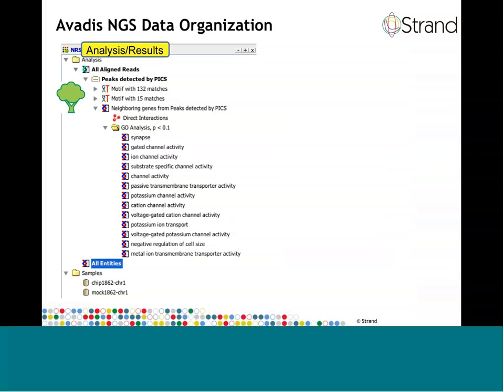So now we have completed a ChIP-seq workflow. It's time to discuss another great feature of Avadis NGS, which is the hierarchical nature of the result storage. In Avadis NGS, the result of any filtering or analysis is stored permanently with the experiment and stored in an hierarchical and chronological order. This makes it very easy to see how you arrived at the results in your experiment when you return to your experiments in a few months from now, when you can't really exactly remember what you did and how you got those results.